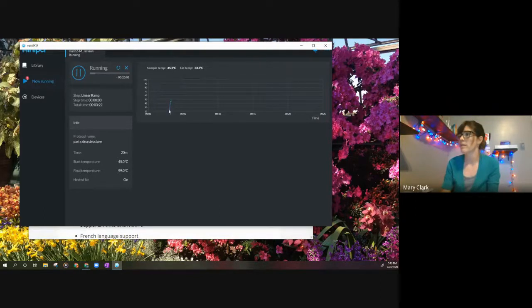You can see this device, we have the heat graph going, so you can see the temperature and what it's at in this machine right now. So now I see that hopefully I will be able to pause this. All right, so I've paused that, which is good. And as this is running, it actually sometimes gives off puffs of air and you can hear it running, hear the fans going in this. So that's all good news, that I know that it's actually going. But now, let's see, so that is done. I want to X out of here.